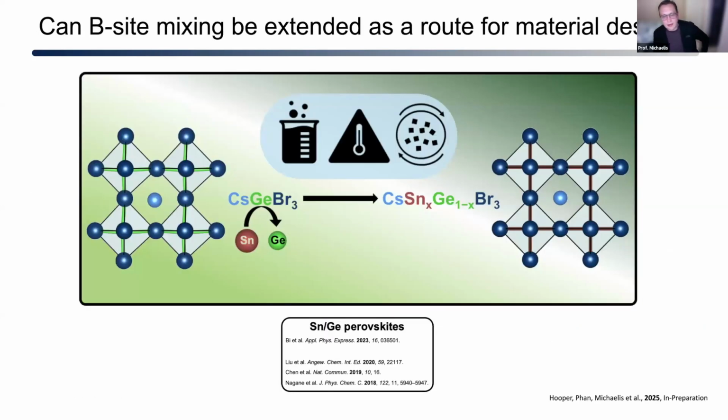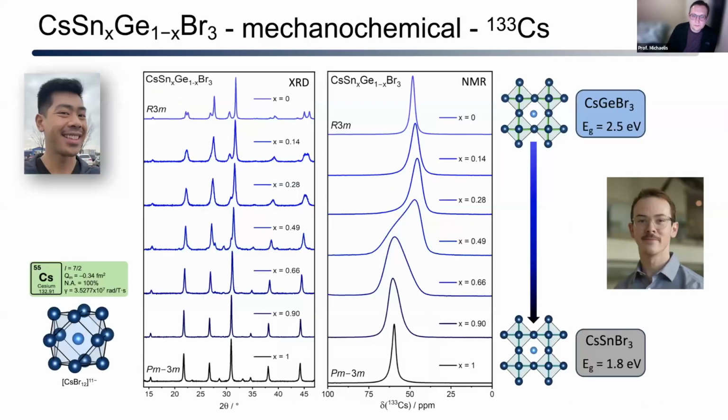This is, again, some work by Riley and some work by Brian, who's taken over, and I'll show this shortly. We do know that the synthetic way we treat them influences their overall property and stability. We also know that we can stabilize the parent phase of the germanium. So can we further improve this through some tin substitution? You make a complex series of materials that are fairly robust, do not necessarily degrade, and don't have any direct toxicity concerns when you're thinking about forming a cell.